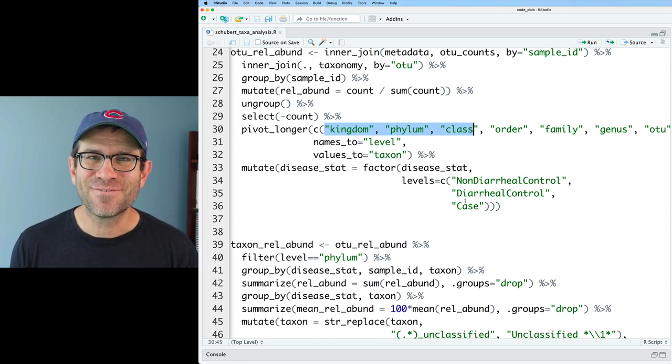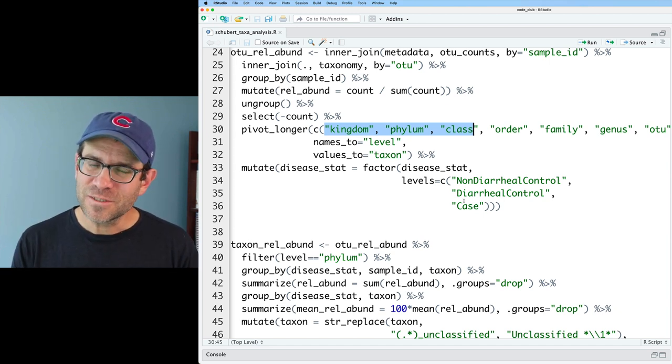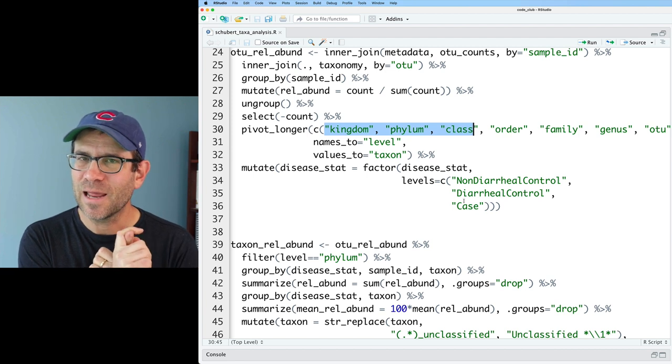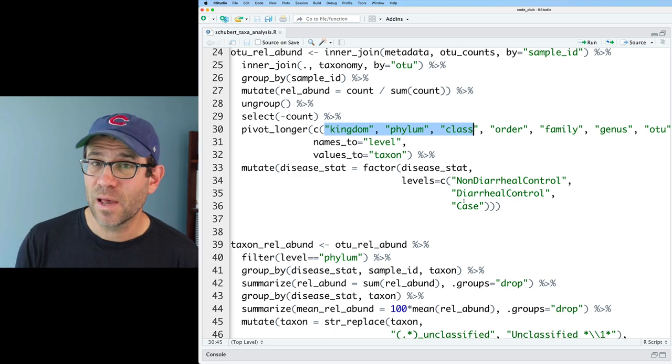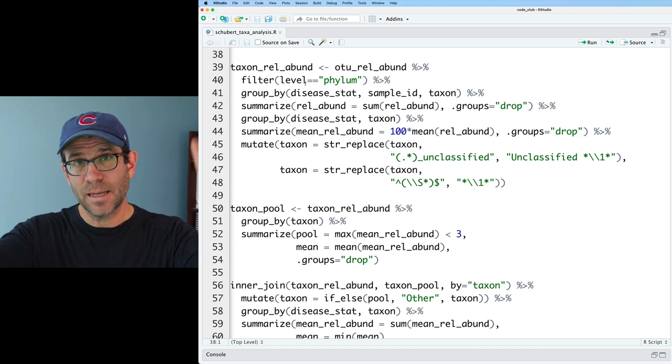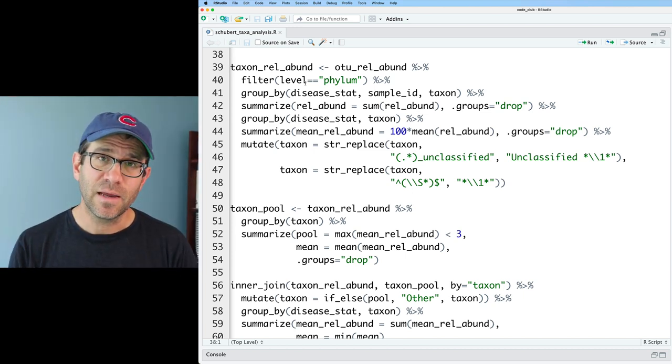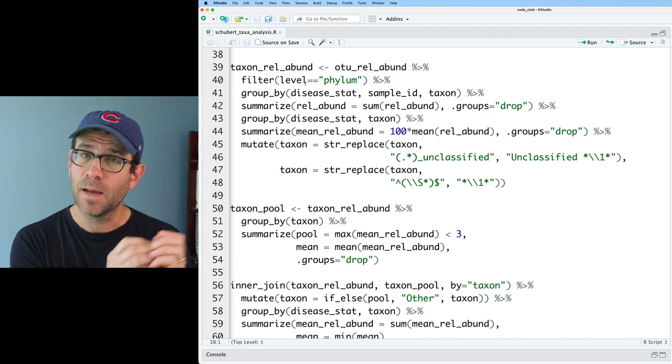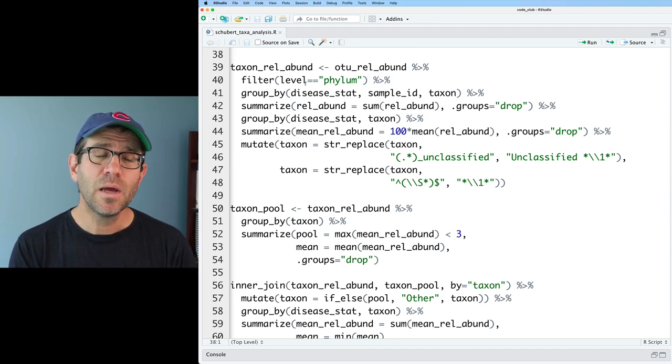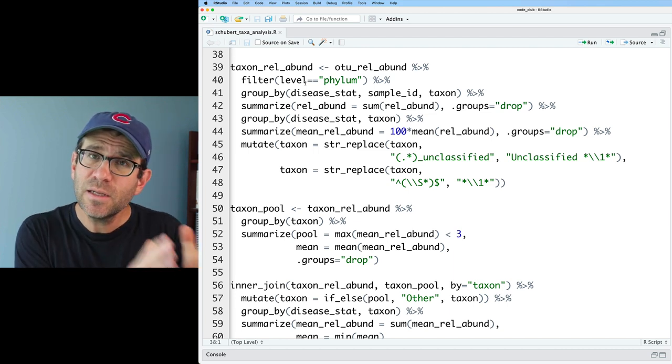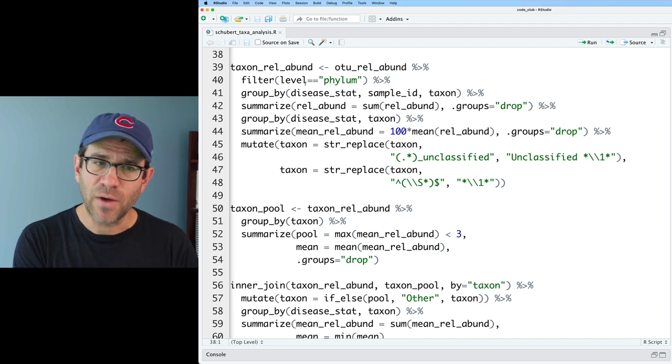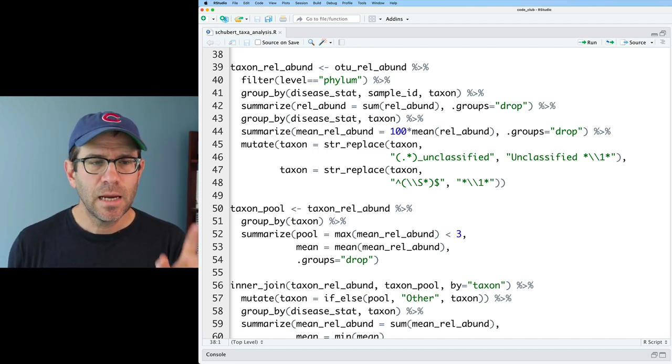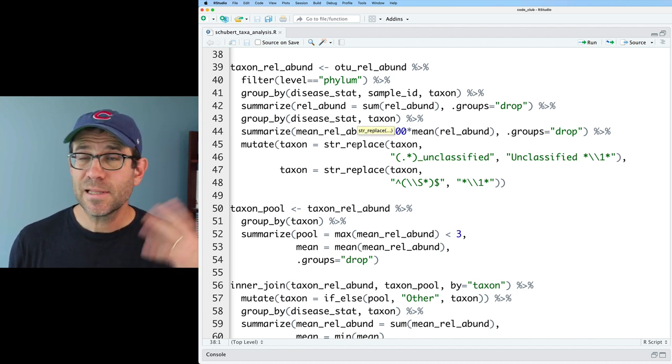These are data from a study looking at Clostridioides difficile infections in three cohorts of people: people that are healthy, people that are hospitalized but have diarrhea, and people who are hospitalized with diarrhea and also who have C. difficile. In this next code chunk, we're creating a data frame called taxon_rel_abund, where we take that big joined data frame OTU_rel_abund. We're filtering it at the phylum level and then aggregating together all the relative abundances for the OTUs that make up each of those phyla. Then we take all of the subjects within those three disease status groups, and within each of those three disease status groups, we calculate the average relative abundance for each phylum. We multiply it so we get a percent.